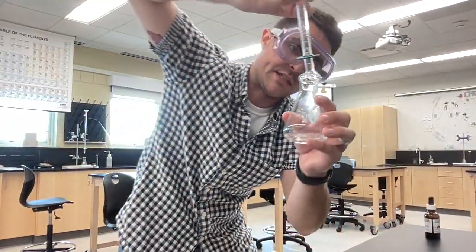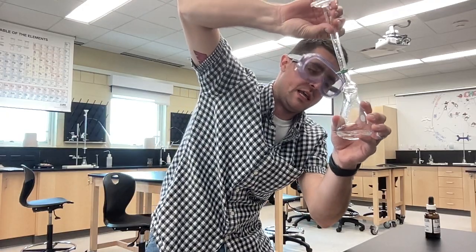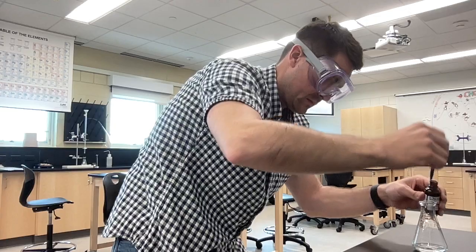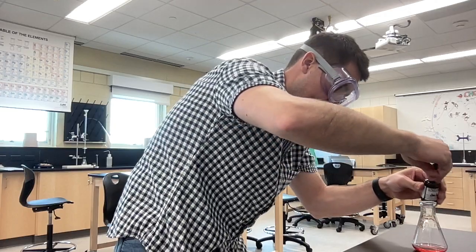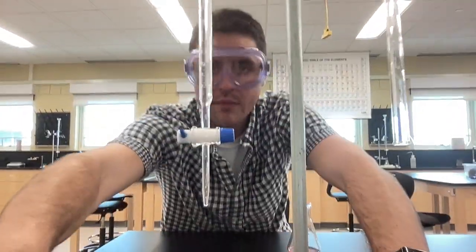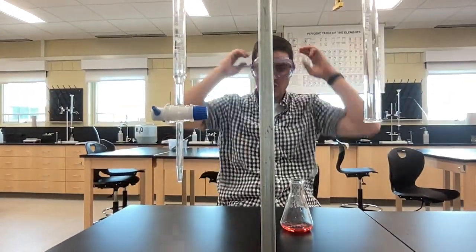I will know it's acidic if I add the universal indicator and it is red or pink. Oh, look at that. Just like I thought, it's acidic. So, you're at home, you predicted, maybe did some math. I've got 1 molar HCl. I've got 0.5 molar NaOH.